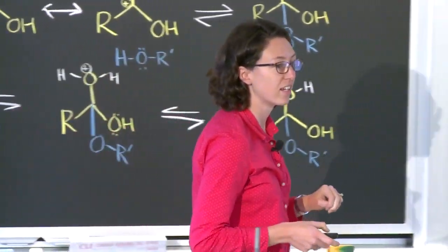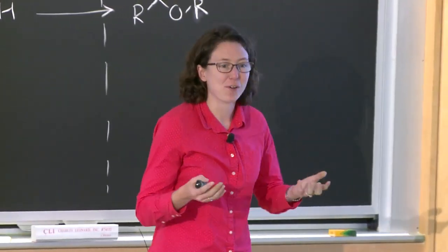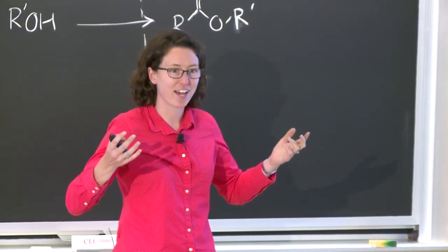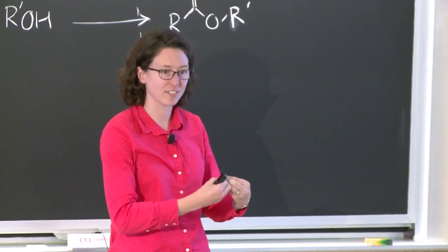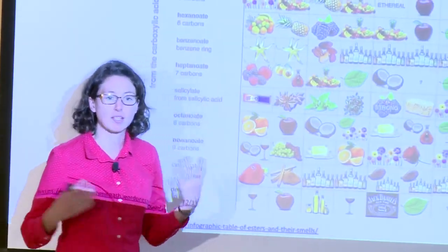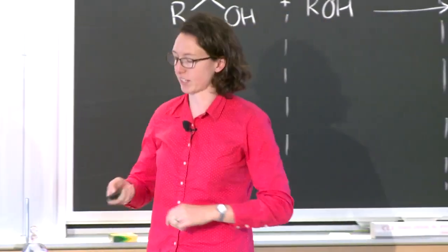What are the boxes you created? Ethereal, that is kind of... I've never smelled something that smells ethereal. Does anyone have a good description of what that may smell like? I think it doesn't have a concrete scent. That's how I kind of interpret that. But you can see there's some that smell like vanilla, pineapples, different fruits. Those are ones that smell balsamic-y, like vinegar, coconut, all kinds of different things.